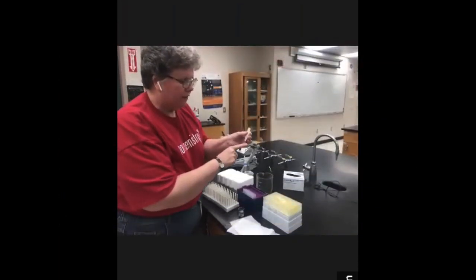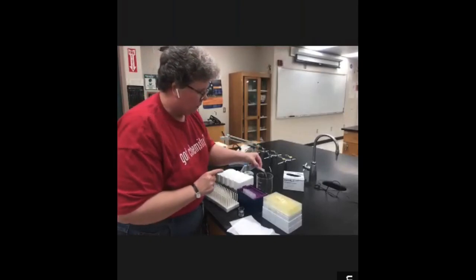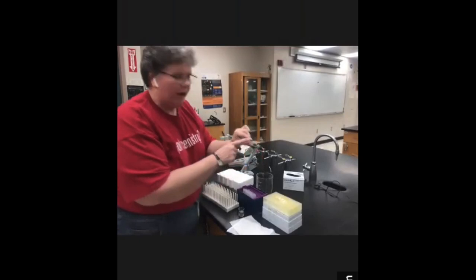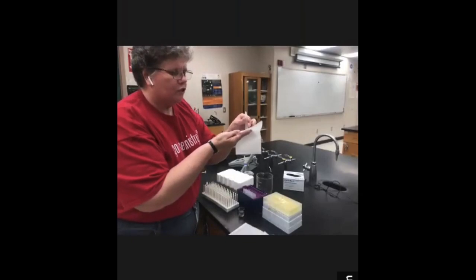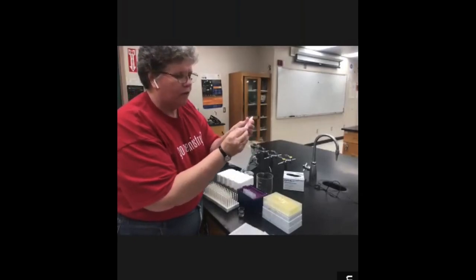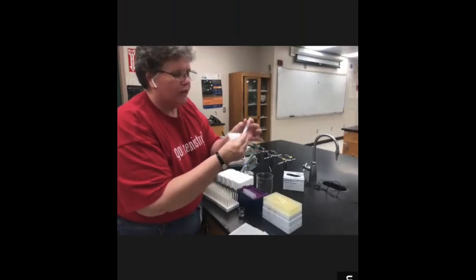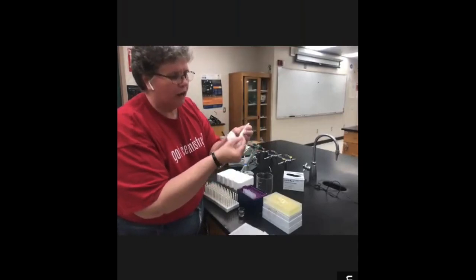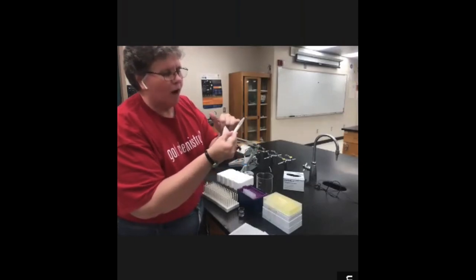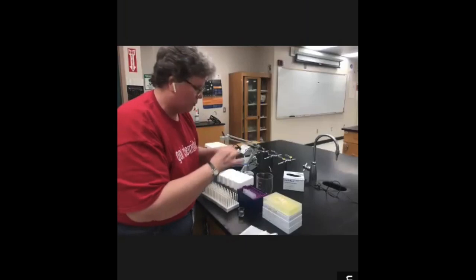Now we have pelleted after the second ethanol precipitation. And again, we are pouring it off and keeping an eye on the pellet. So this is the small pellet right there. You can take a Kim wipe to blot the excess liquid coming off. You can even put the Kim wipe a little bit into the tube to get off any excess ethanol, to avoid having ethanol on your pellet when you bring it up in water. But you don't want to get that Kim wipe anywhere near the pellet, because Kim wipe versus pellet will lose every time. It will suck up your pellet and you will never see it again.